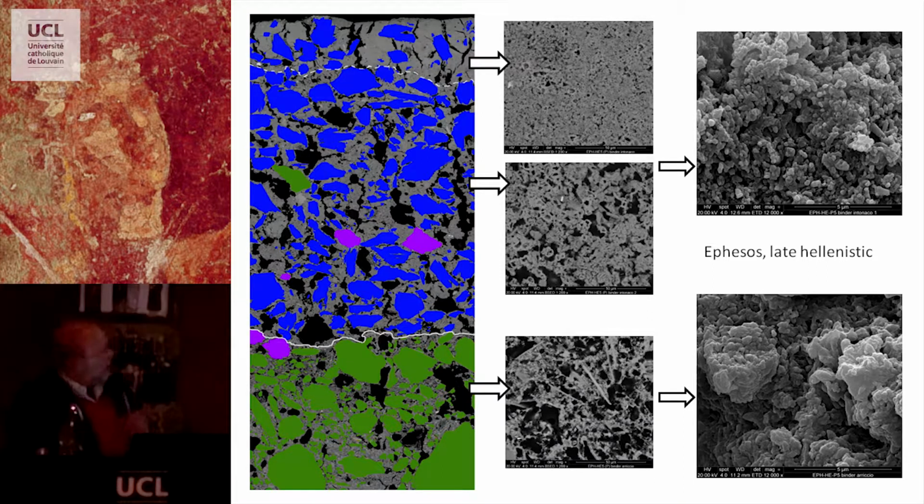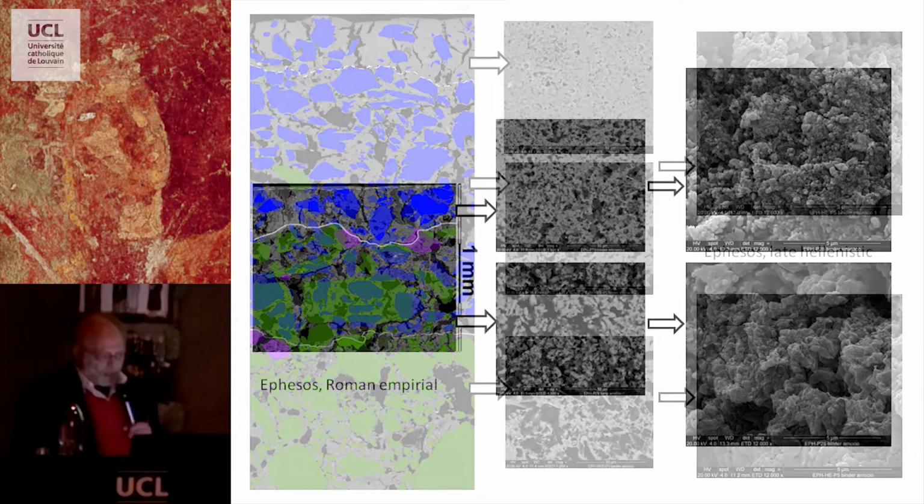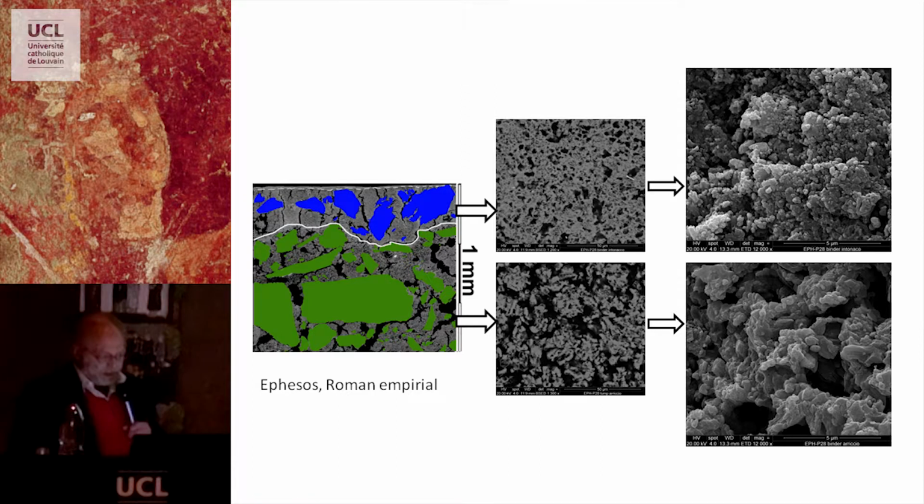And these are again, on other broken surfaces, the microstructures of the binder. Second example, similar. Everywhere we have these bright intonaco layers or surface layers. We have a very compact matrix of the lime.